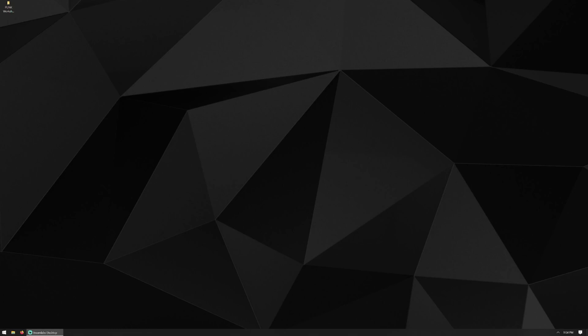Hi, y'all. This video is going to be pretty short. It's just to get people from having never used Plink to having it running on your PC to do local analysis with. If you use a Mac, I'm afraid I can't help you, but this will work for both Windows 10 and Windows 11. I'm running Windows 10. If you're running 11, it might look a little bit different, but all of the commands should be the same.